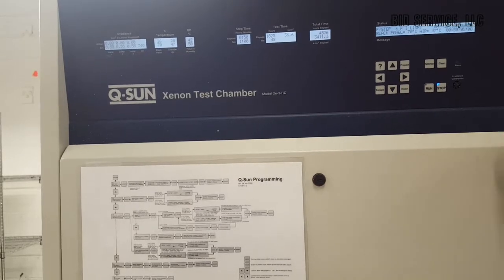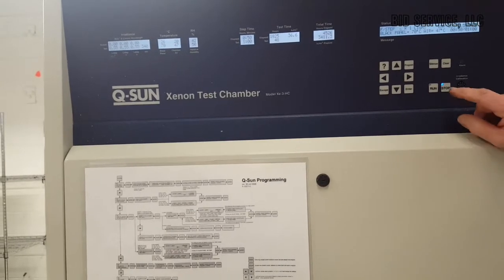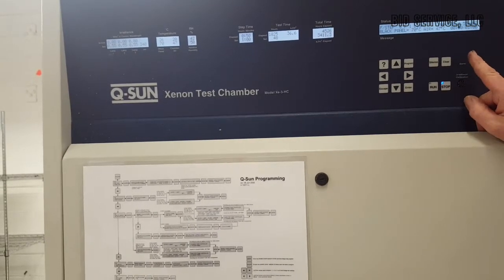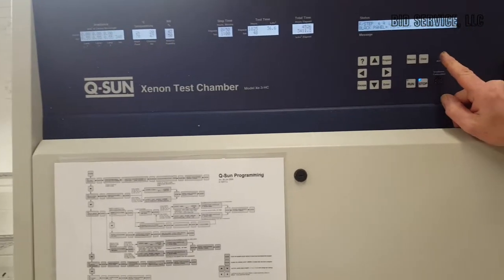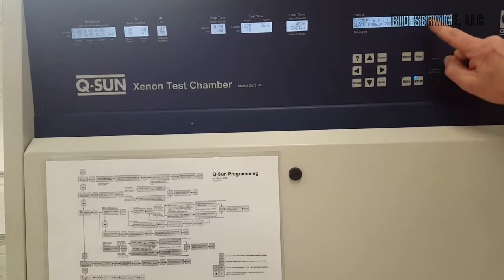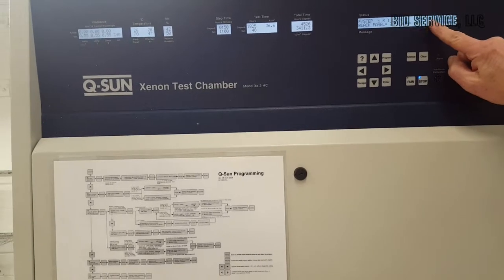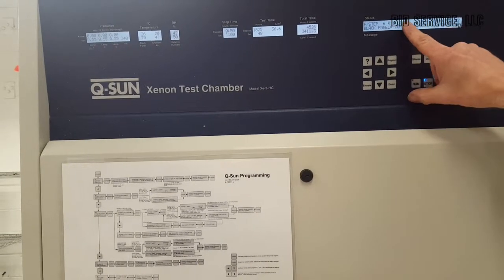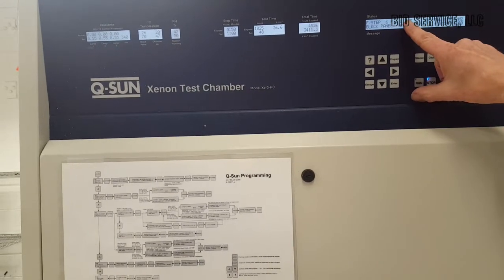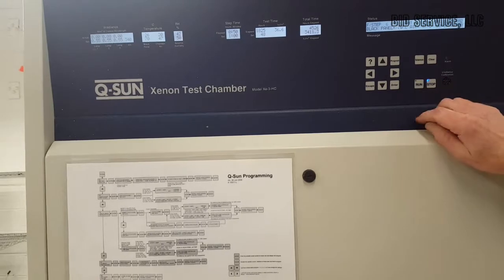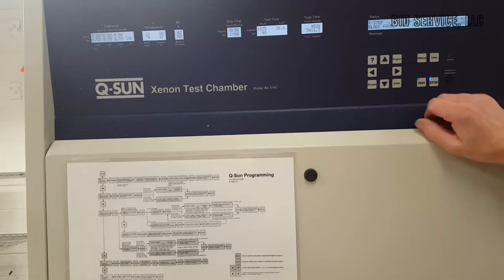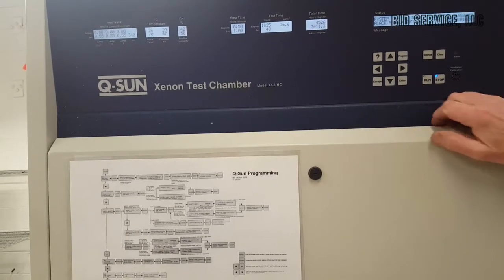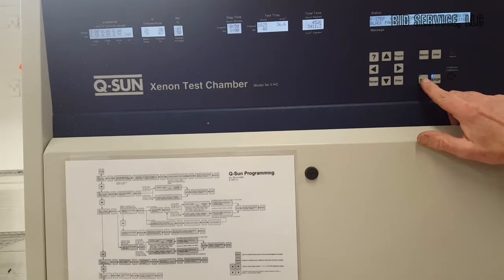So I'm going to start by running this system by turning both the humidity on, adjusting the temperature, and turning on the Xenon lights. Now, normally when you start, you hit run.